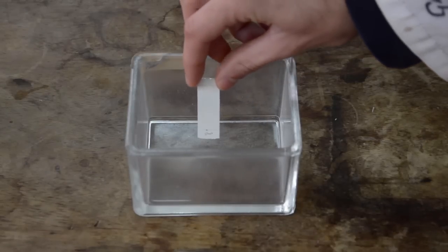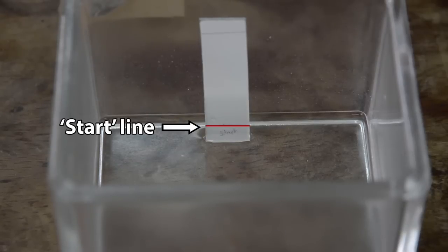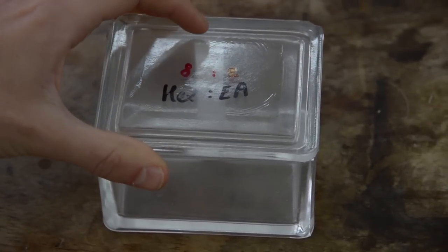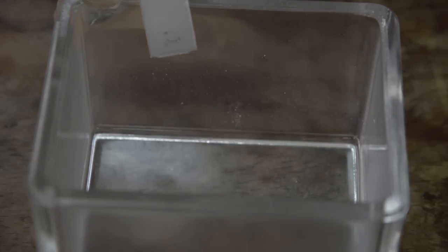Immerse the TLC plate into the solvent jar, ensuring that the height of the solvent is not higher than the start line on the TLC plate, and allow to stand until the solvent front reaches the finish line at the top. Remove the TLC plate and allow to dry using a heat gun if necessary.